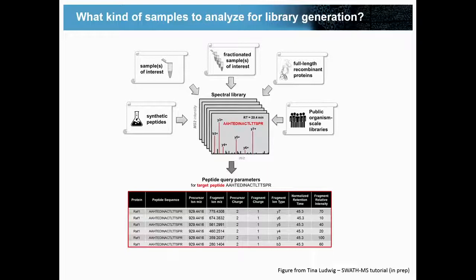And this might be worth doing because, at least in our experience, we find that the single-shot DDA analysis is less sensitive in some cases than the single-shot DIA analysis. So that means that in order to exploit the DIA data most completely, you would need a more comprehensive or deeper DDA analysis of the samples of interest in order to reach this. So this is why we would typically do some kind of fractionation.